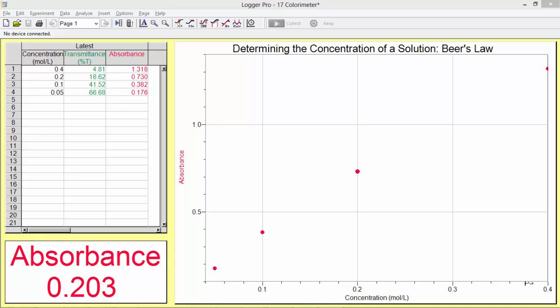Alright, so I wanted to create this little tutorial video on how to graph your data in Microsoft Excel. So right now we're looking at concentration and absorbance data from your standard solutions, which you'll use for your final project. Right over here we show the concentrations, and here we have the corresponding absorbance. We can ignore the transmittance data because we're not concerned with it.